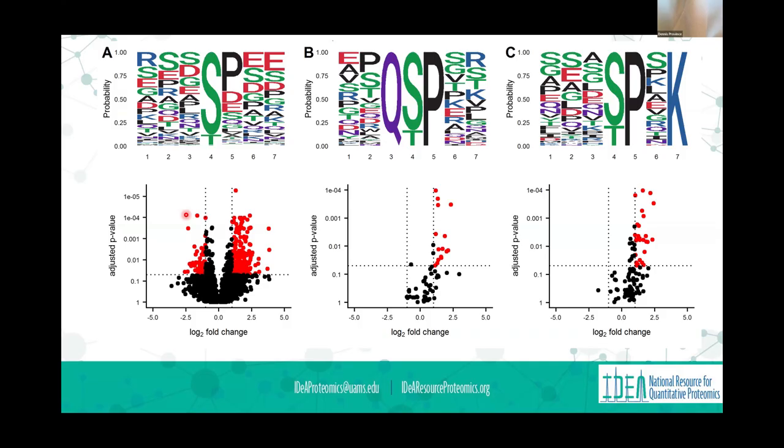There's lots of software that you can take the sequence of peptides and generate the motifs. For example, how do you read this figure? Oh, that's just showing that of all these peptides, they shared a serine in the 4th position, and 20% of them had a proline after the serine. There was a high percentage that had acidic residues after the serine.